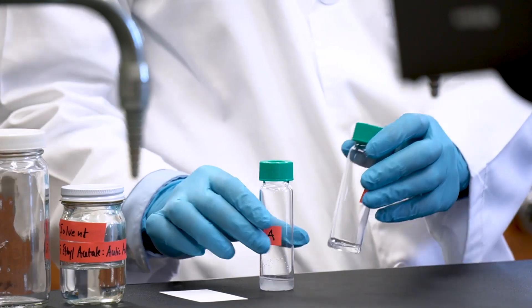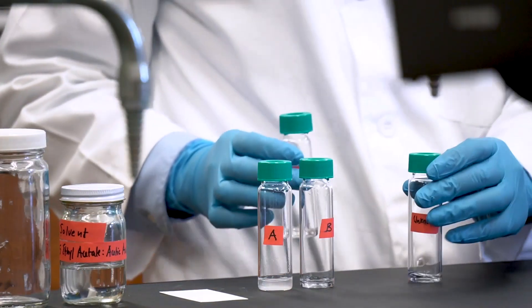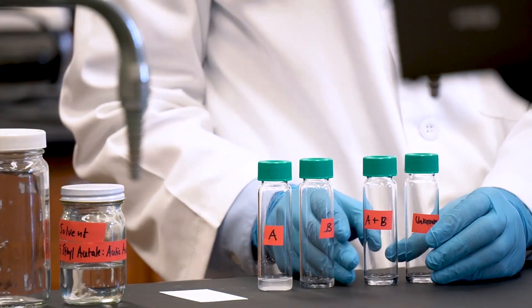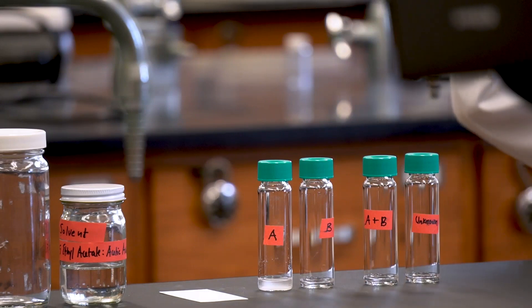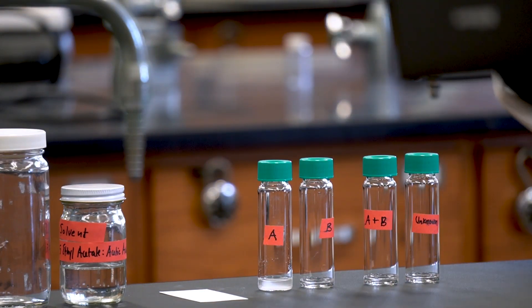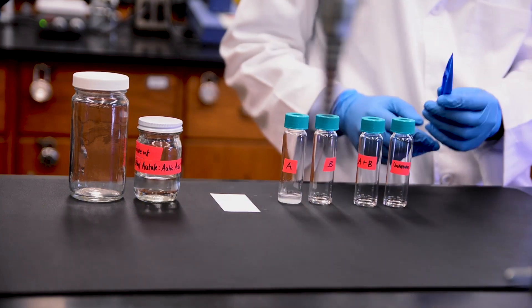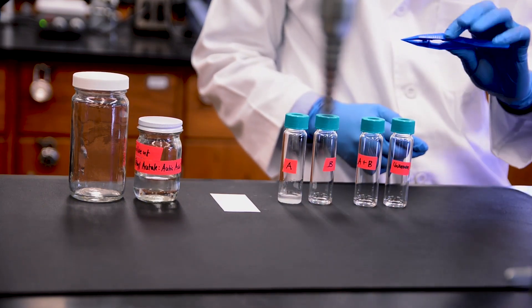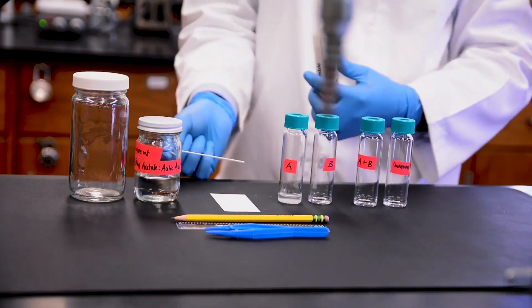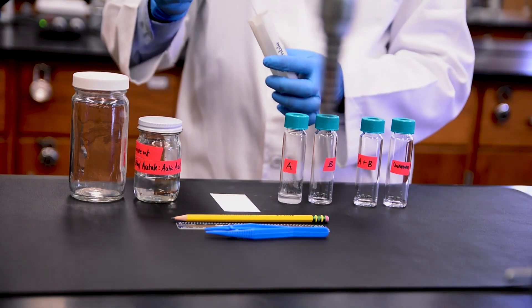Today we're using two known sample standards, caffeine and aspirin, which we will label A and B respectively. We also will test a mixture of these compounds, as well as an unknown sample, to see if it is A, B, or a mixture of the two. This is one application of TLC: substance identification. Lastly, we will need some tweezers, a pencil and a ruler, and some capillary tubes. These are what we will use to spot the plate with our samples.